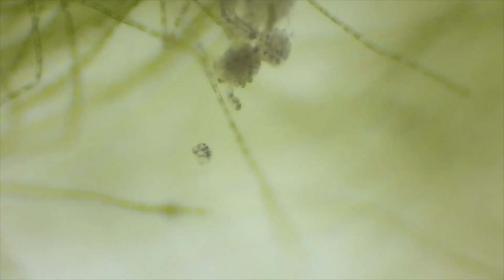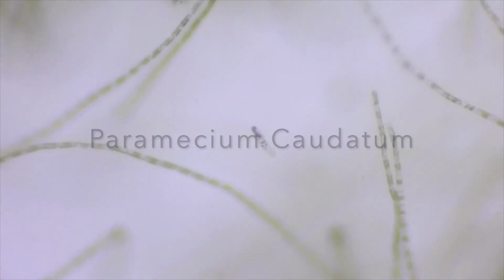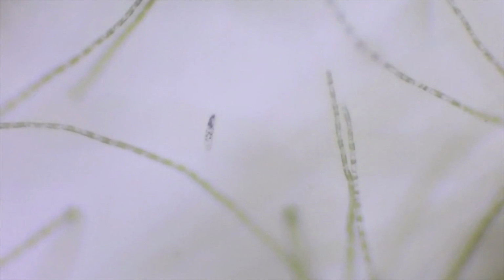A Paramecium, further classified as the Paramecium caudatum. They are single-celled organisms that reside in aquatic environments and feed on smaller microorganisms like bacteria. Their cell membrane is covered in cilia, which is how they move, and the black dots inside their cell are their organelles.